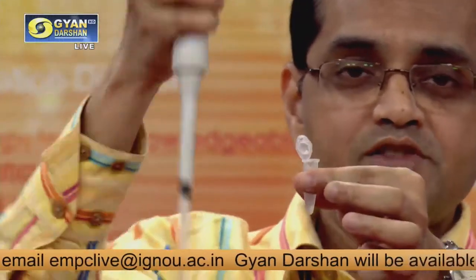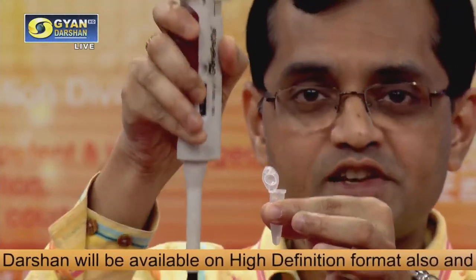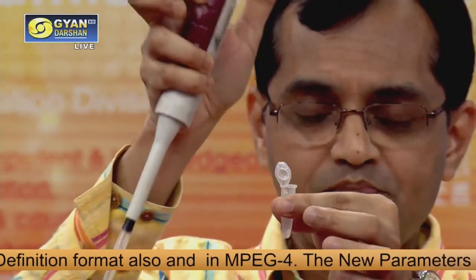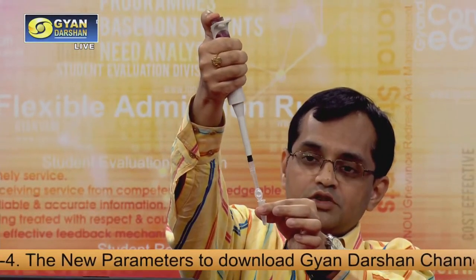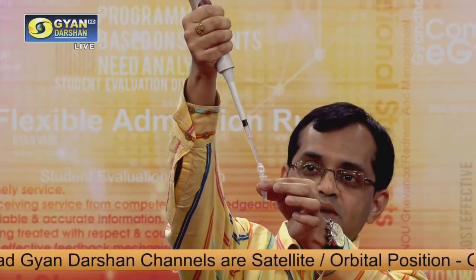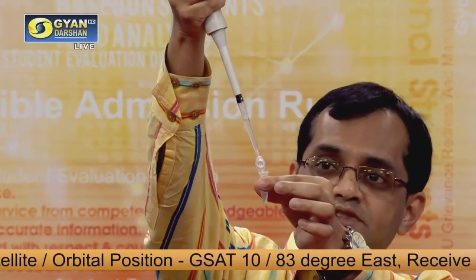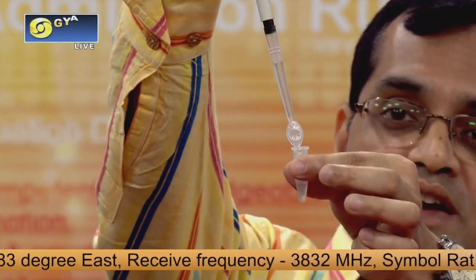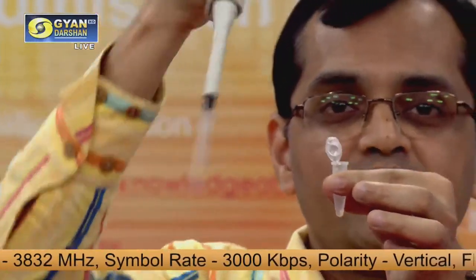Because this instrument you have to use very regularly when you are doing such experiments, you have to have a control over this pipette man. So that is the way I am showing you again. You can just pipette it out like this. Make sure that there are no air bubbles. You should pipette it out very gently, and when you put some solution inside, again do it very gently and resuspend the pellet in this solution.